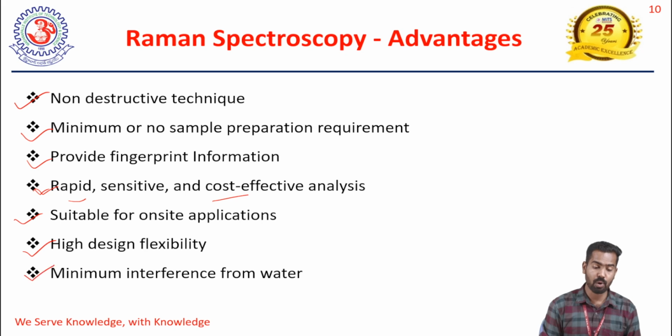And the final point is very, very important. In IR spectroscopy and Raman spectroscopy, we are getting the vibrational information. But why are we focusing more on Raman spectroscopy?